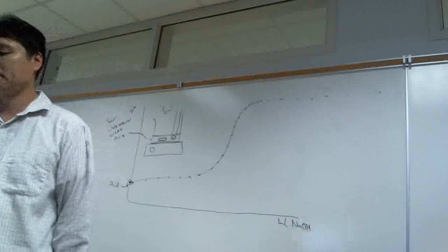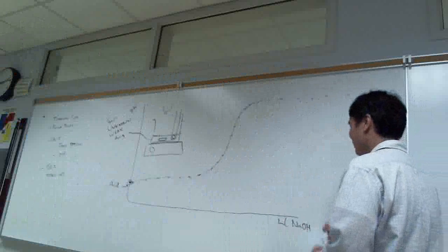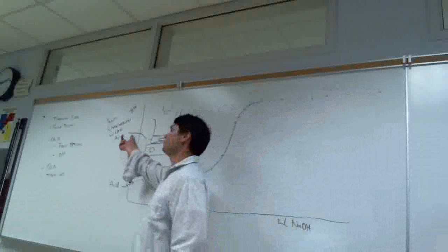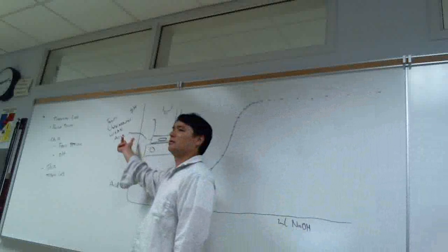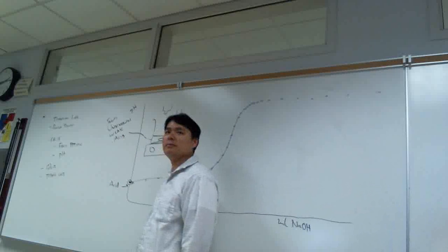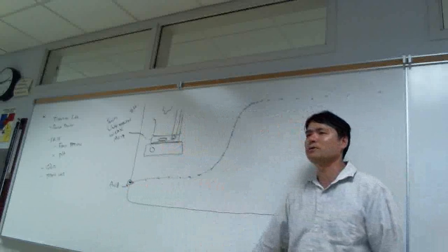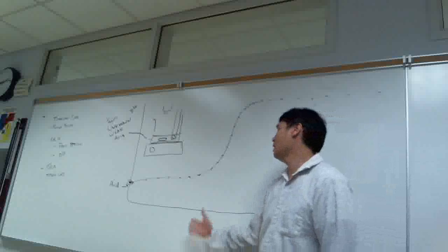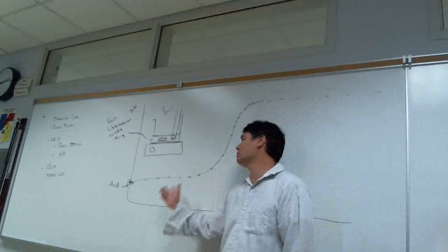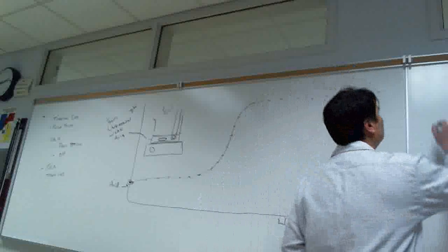That's a big question. And so when you slow down, well, we have no idea. Because, I mean, how many grams of unknown acid do you use? That varies, right? The people are going to weigh different amounts. If they weigh different amounts, then where we slow down is going to be different for each person. And so this type of titration is very time consuming. And so before doing this titration, what we're going to do is we're going to run a trial titration.